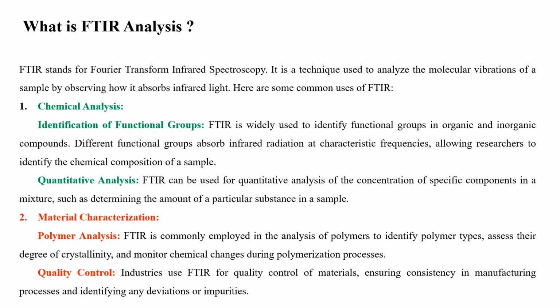Chemical analysis. Identification of functional groups. FTIR is widely used to identify functional groups in organic and inorganic compounds. Different functional groups absorb infrared radiation at characteristic frequencies, allowing researchers to identify the chemical composition of a sample.